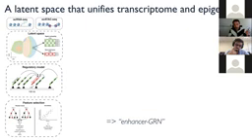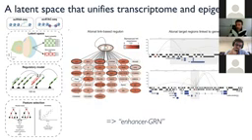So if a genomic region is accessible only in this domain in the antennal disc, and the nearby gene is only expressed in this same domain, then the weight of this link will be very high. And this way, this is all linked. So here are some examples of a gene, scabrous and fill, and the regions linked to it. And so now we can prune the SCENIC regulons, in this case the Atonal regulon, by using only edges in this network that go from the factor to a region that is co-accessible where this factor operates, and that region is linked to the target gene. And so this is now the pruned, higher quality regulon.